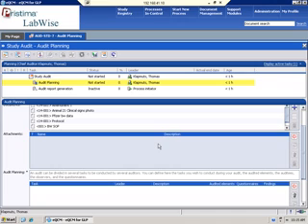Attachments are things that are external of the document management system. So if it was something that you needed, a good example would be if you were traveling to a site and you wanted directions. You can load a Google map into here, or written directions, or your travel itinerary if you're traveling, so that when you're remotely accessing the system, you'd have those documents available, those attachments.